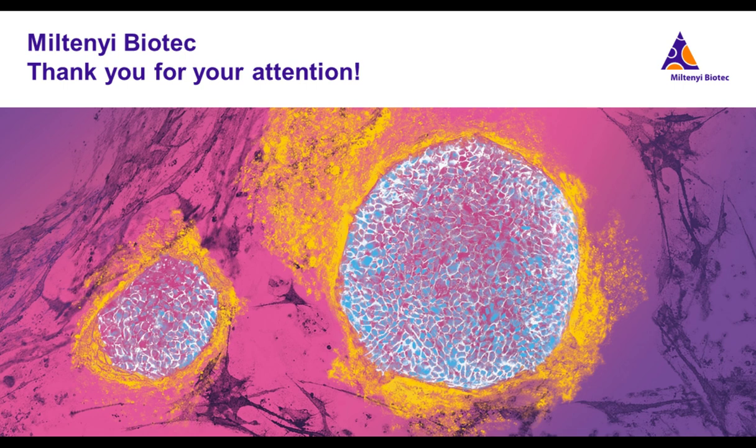Next question: how much antibody is used per round per marker? That depends, of course, on the size of your sample. We are offering different sample carriers for standard microscope slides. We are offering MACSwell disposables with 4 chambers, 2 chambers, and 1 chamber, depending on the size of your sample. You can expect costs between €3 up to €20 per antibody.